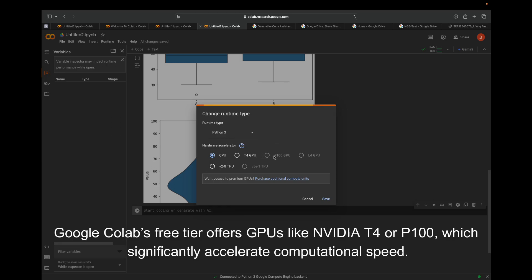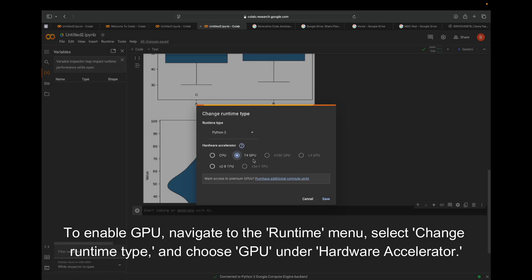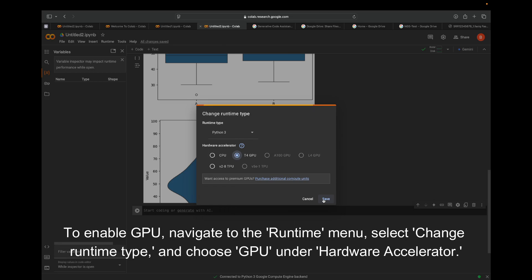To enable GPU, navigate to the Runtime menu, select Change Runtime Type, and choose GPU under Hardware Accelerator.